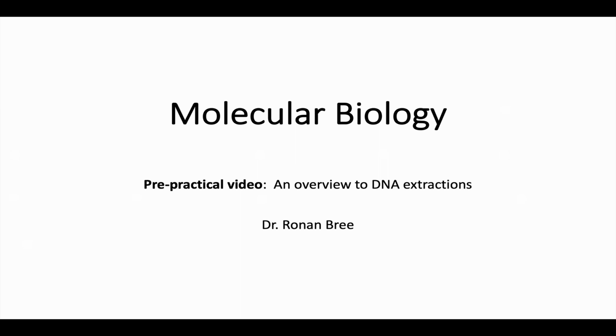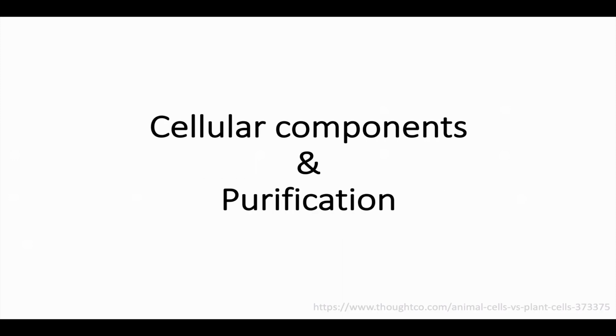In this video, we're going to look at an overview of genomic DNA extractions. So essentially, first, I want you to think of a cell and all the components within it, and then imagine you're going to try and purify or isolate one aspect away from all the rest, because that's essentially what we're going to do in this session.